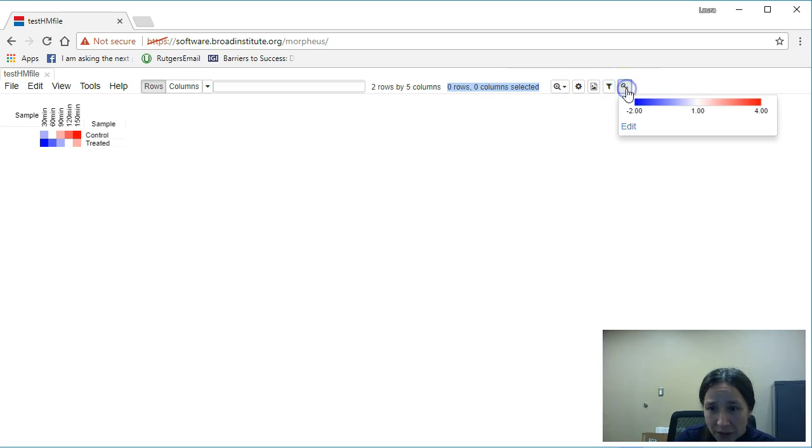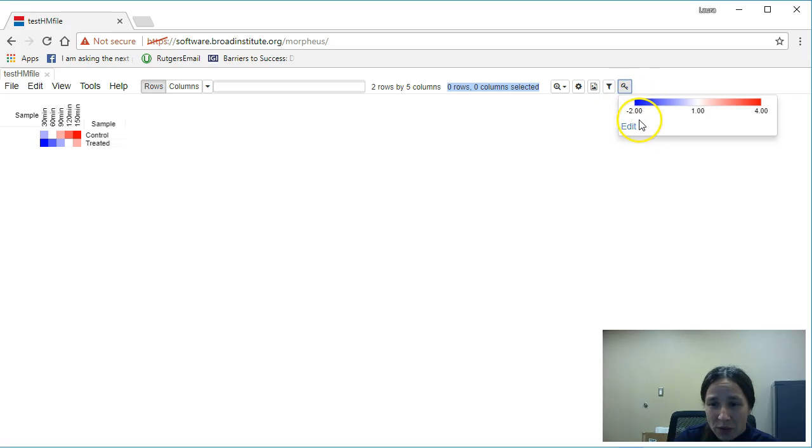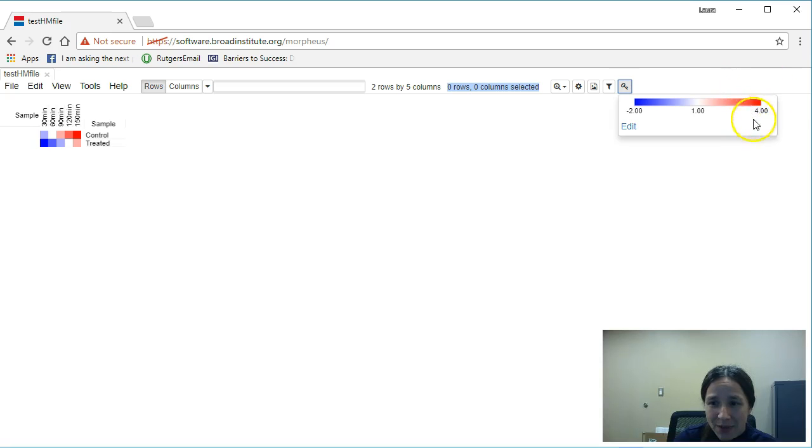And my color key represents my lowest value in the matrix at blue, all the way up to red, my highest value in that matrix.